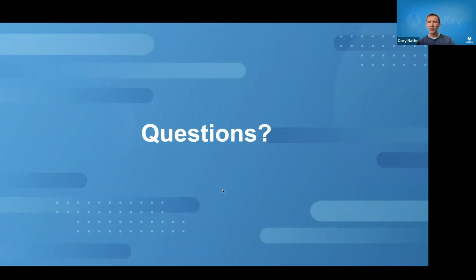One more question before we get back to the talk. Can any complex input form be developed without using Java code? The definition of what you mean by complex there is interesting. You can definitely get pretty complex. Rosalind showed an input form that does not use Java code to upload a file attachment and to do a date picker. You could also do validation across your form inputs within JavaScript. So there's quite a bit of complexity you could do.